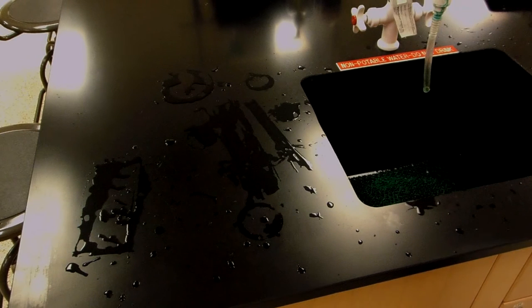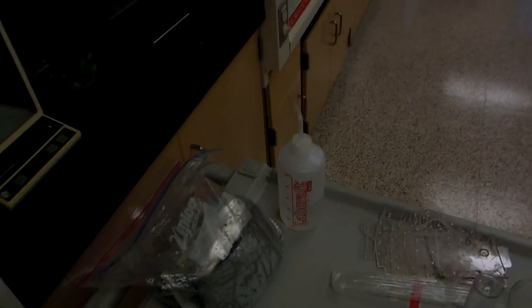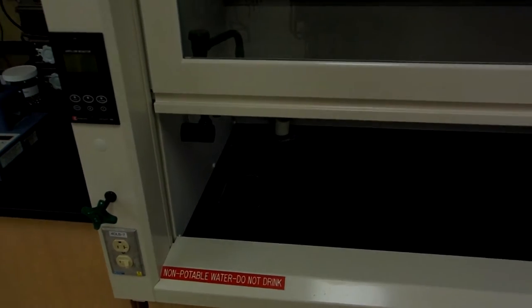So now, you can see my cart set up. Most of the things I'll need are present on this contraption. You can see my entire bag of Mylar, cut and ready to go. The fume hood is present adjacent to the cart. It's a Supreme Air brand, very nice brand, and there's a little sink there, good for doing some rinsing if needed. And an outlet with a light switch.